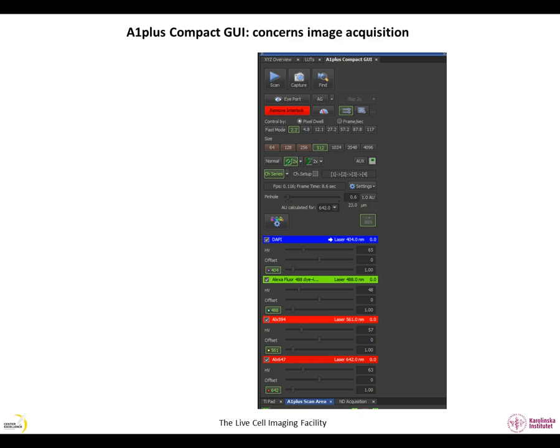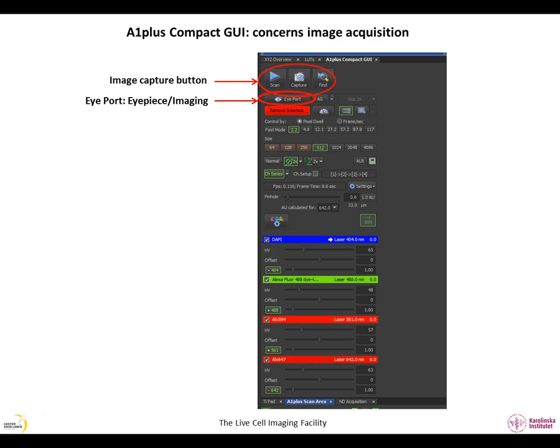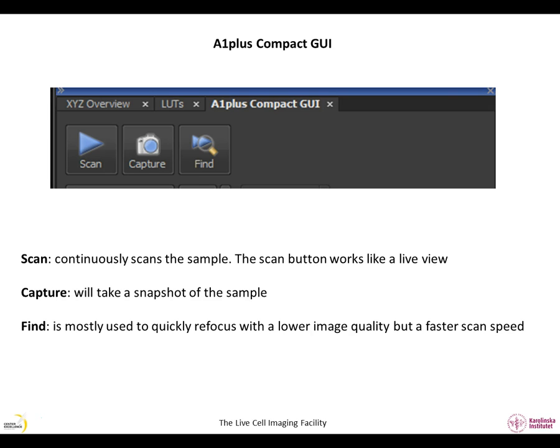The next tab is the A1 Plus Compact GUI tab. It provides you with all the features concerning image acquisition, scanning, excitation and detection. In this video, I will describe three functions displayed by this tab: the capture function, the eye port function and the light path function. On top of the A1 Plus Compact GUI tab, you will find the scan, capture and find buttons. Scan continuously scans the sample. The scan button works like a live view. Capture will take a snapshot of the sample. Find is mostly used to quickly refocus on your sample with a lower image quality but a faster scan speed.